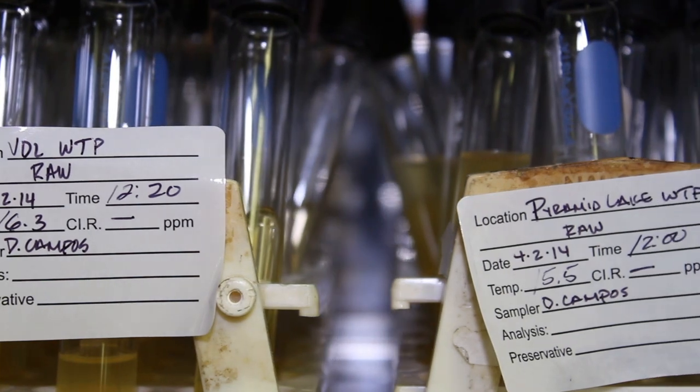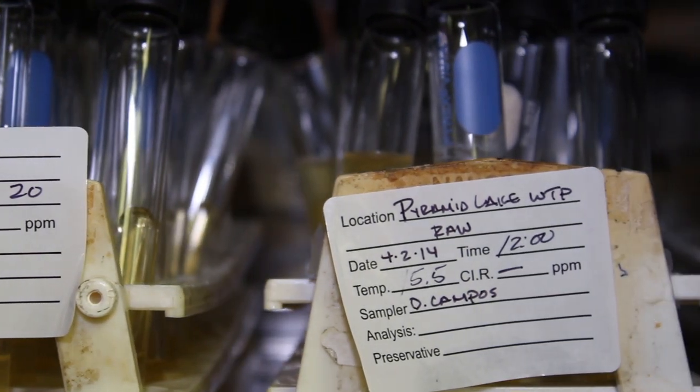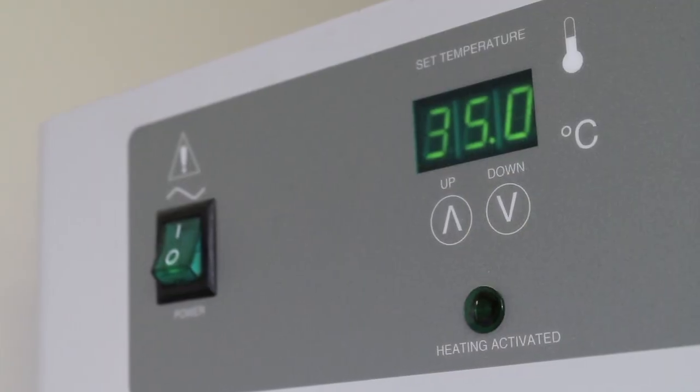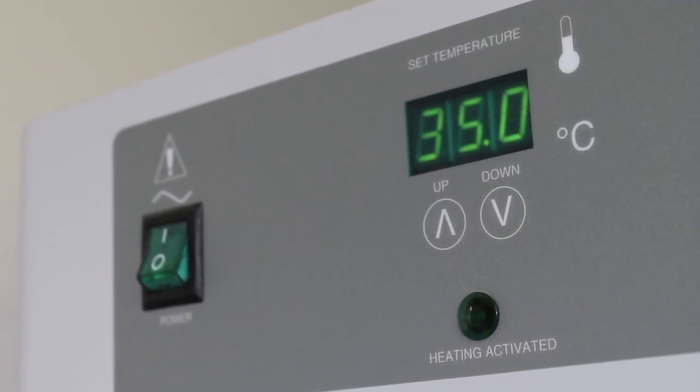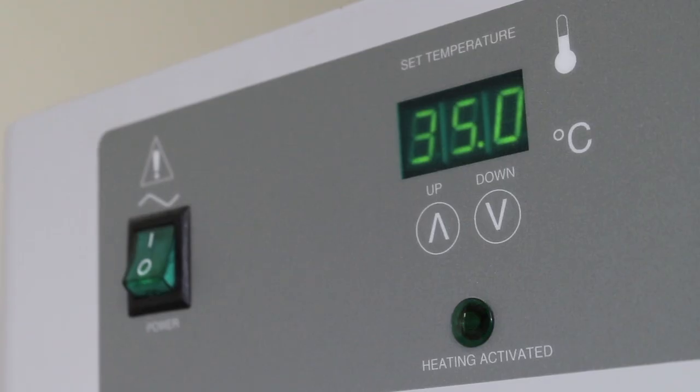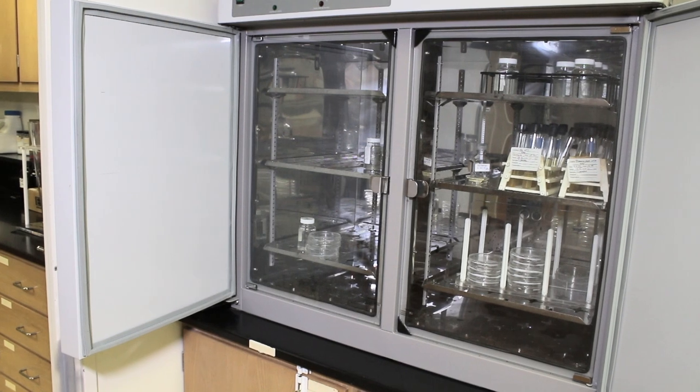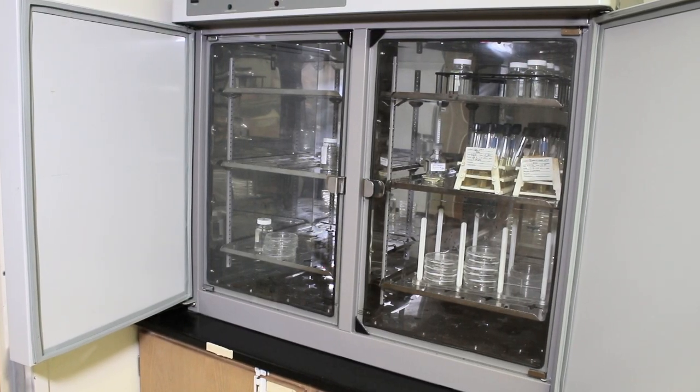The incubator is a laboratory device that provides a dark, constant temperature environment. The temperature is 35 degrees Celsius, approximately human body temperature. Together with the supply of food and water, the incubator is an ideal growth environment for the coliform bacteria.